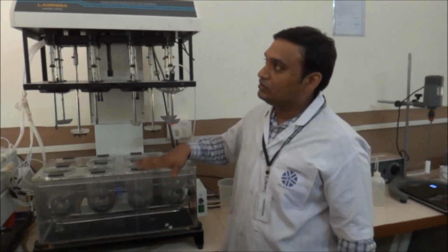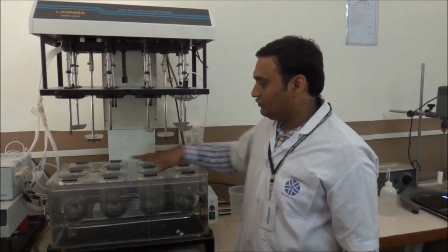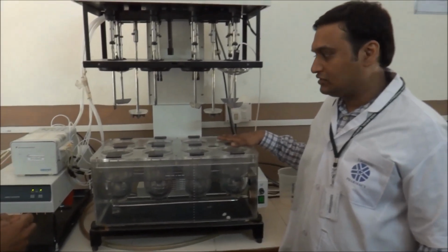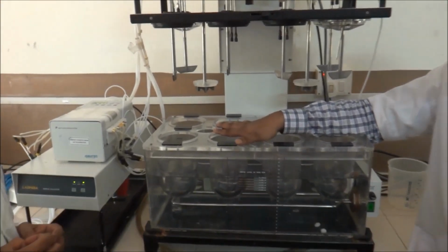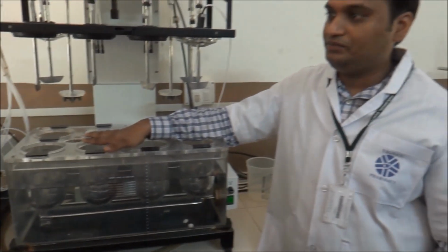The 2000 doesn't indicate any ml here. Of these 8 beakers, only 6 are used for testing, and the other 2 are only for replacement. So this instrument is generally referred to as a 6+2 dissolution apparatus.